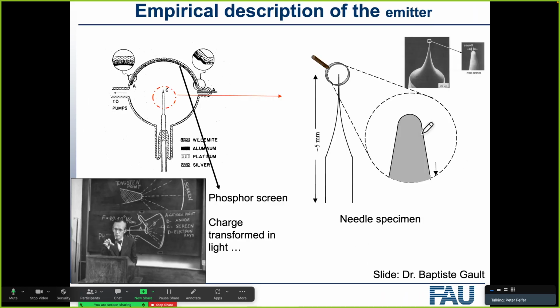Okay, so how does the whole original setup work? The original setup is very simple. You have a glass bulb that you can pump out, evacuate. And eventually you have a closed system, because this was all done via glass blowing. So you had a power supply to the specimen, which serves two purposes. Well, you could clean the specimen by heating it. We no longer really do that because we usually exchange specimens rather than refurbishing them. And you can apply the high voltage to a specimen.